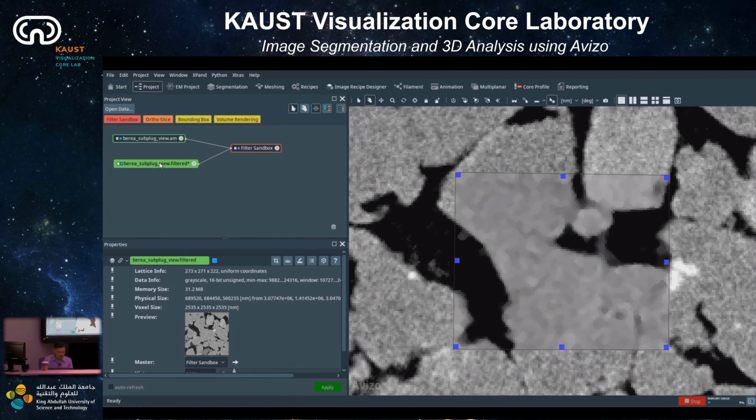You can rename everything using F2. Press F2, and let's say I change this to just the name of the data. Again, let's say I change this one with F2 and name it just the filter. You can even say median filter, so you know, if you want to compare different types of filters, median filter, like this. So now maybe it's easier for you to find the data or understand better what you're looking at.